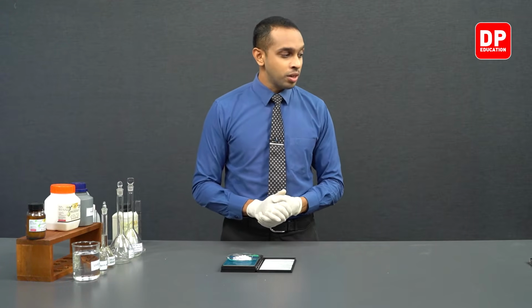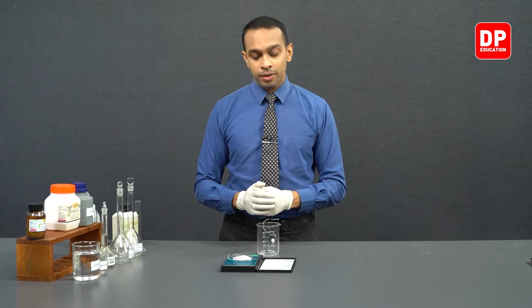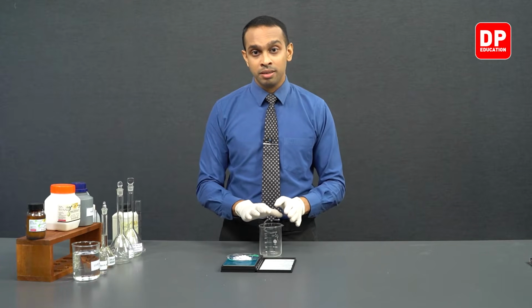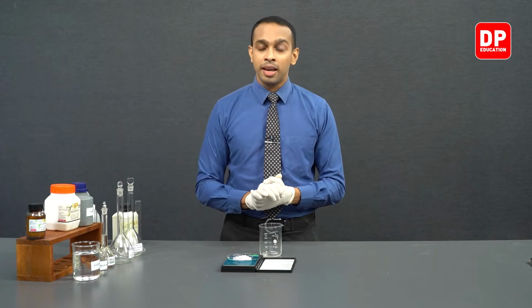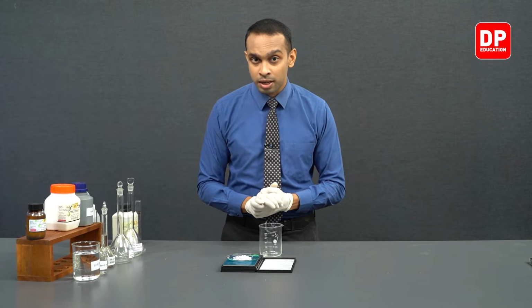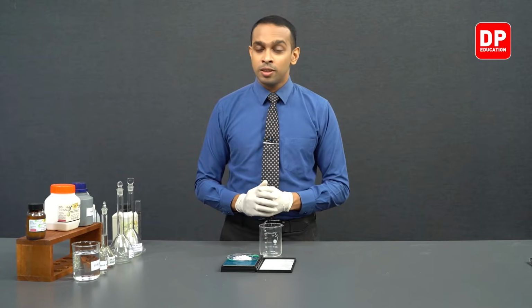Since it can be a little bit difficult to dissolve this ammonium ferric sulfate in sulfuric acid or in aqueous mediums in general, we can use a small beaker, and we are going to transfer this ammonium ferric sulfate into the beaker and then dissolve it up to a certain extent in the beaker, and then we'll be transferring into the volumetric flask, and we'll be preparing our acidified ammonium ferric sulfate solution in a 250 milliliter volumetric flask.